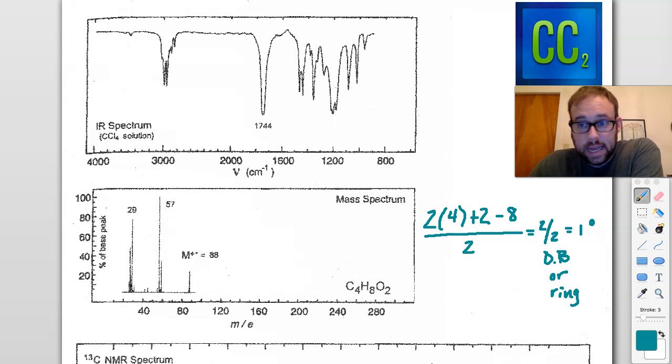Let's hop over into the mass spec and see if that has anything to tell us. So we can see the M plus peak at 88 means that the molar mass for this compound is 88 grams per mole. Now, we could have done that with an addition of all the elements down here.